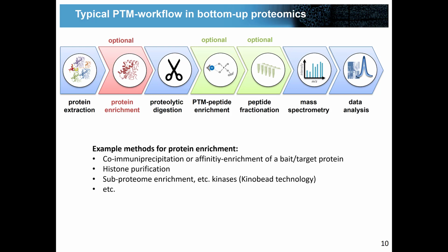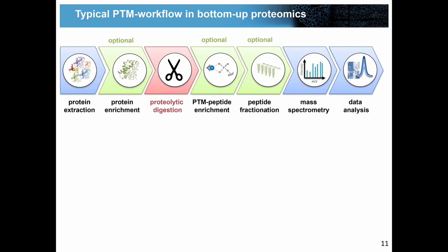Okay, the next step in the workflow, again an essential step in bottom-up proteomics, is the proteolytic digestion. We heard already from Andy how important this step is, and how variable it can be, and how long you digest with trypsin, or whether you shake or not.